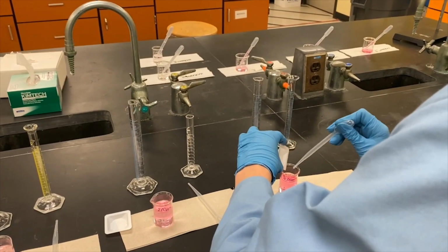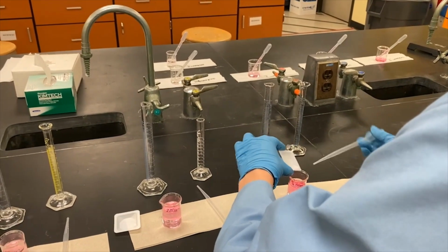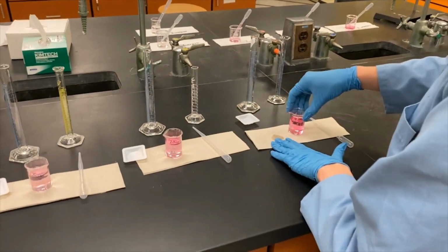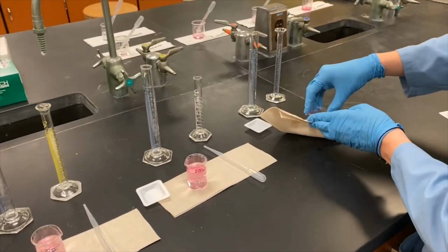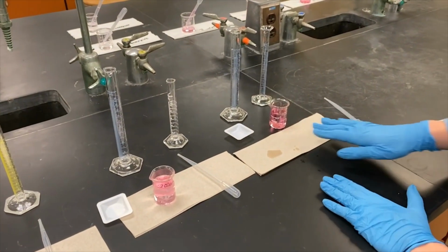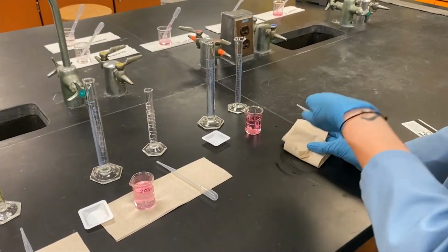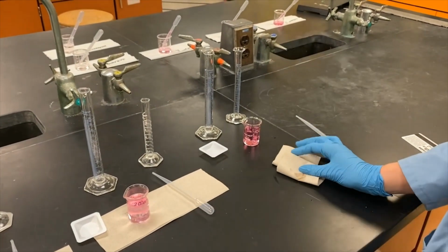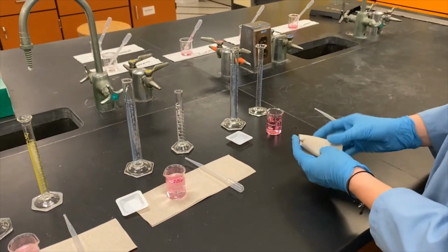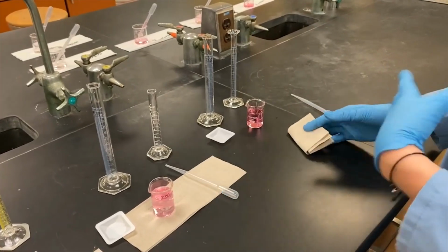I got a little bit of a spill there, but that's good because I actually did want to talk to you about spills in science. Luckily this spilled on the paper towel, but if it had gotten on the counter, we would want to make sure that we did our job wiping it up. In this case, this is just water and chlorine stock solution, which is safe for us to pour down the sink and wipe up, but if it were an acid or a base, we would need to talk to our instructor and clean it up accordingly.